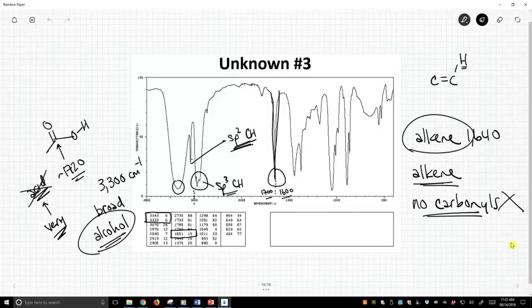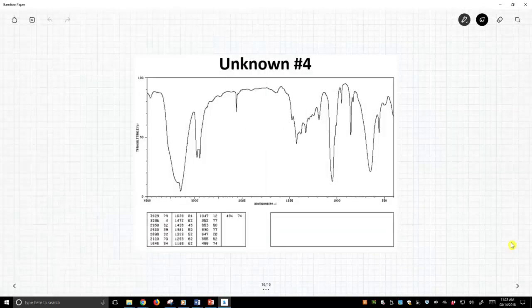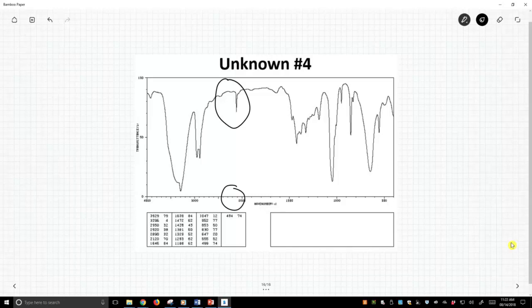Okay, so let's see another example. Here is a molecule. Oh, this region right in here. If you have anything here, normally it stands out because nothing shows up in that region. So we have a peak. Where is that? It's around 2100-ish. So let's find it exactly. 2120 is our peak. It's a weak peak, but still it sticks out. If something is less than 2200 in here, that's typically a sign of an alkyne. So I think we have an alkyne in this molecule.